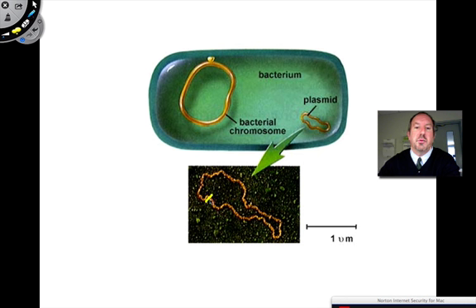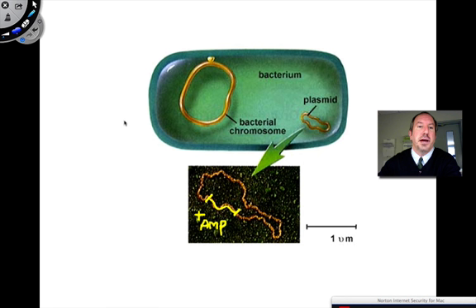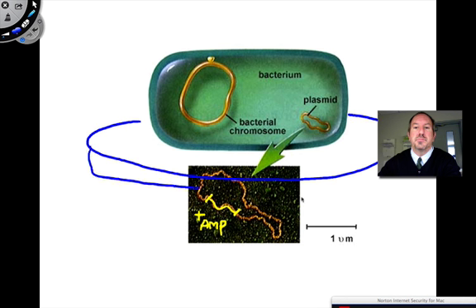And so let me just say from here to here is a gene that makes this bacteria resistant to ampicillin. And so I'm going to write that. I'm going to say positive. So it has a gene for this. And so, in other words, if I were to grow, this is going to seem a little bit weird, but if I grow this bacteria on a petri dish with agar, like this, and I place some agar in here, not drawn to scale because this is really big.